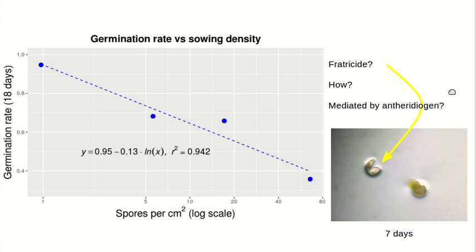You can observe germination failure empirically just by looking in your plates for spores that didn't make it. Here's a sad spore that didn't make it — it dehisced, but was unable to produce any viable contents. That's one example of a germination that failed.